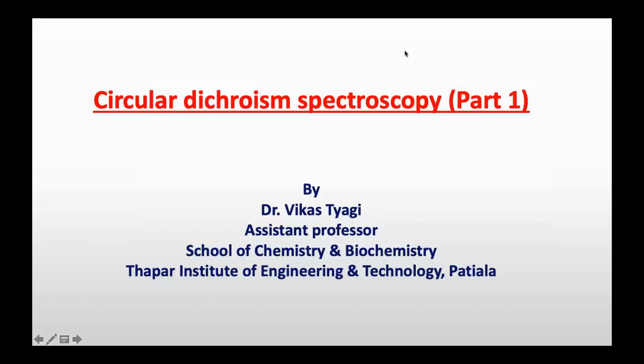Everyone, from this lecture I am going to start circular dichroism spectroscopy, which is important to find the stereochemistry of organic molecules.